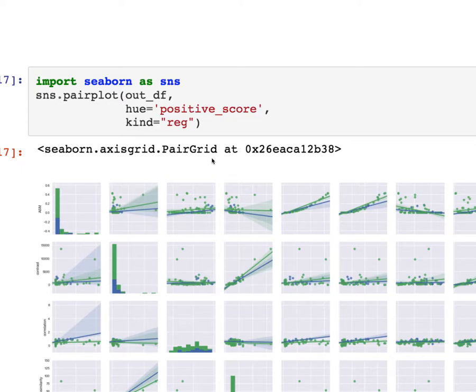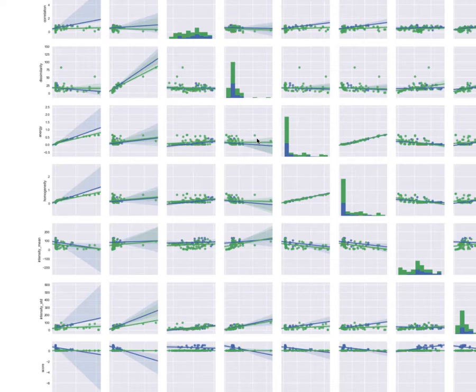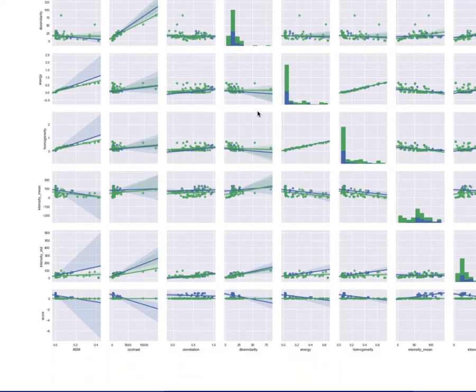This is also one of the exercises where you try to do this with mitochondria, to find out what textures identify mitochondria and which ones don't. This isn't ideal for segmentation, but it can be very helpful for excluding segments that you don't want to keep, or segments that aren't of the right region, because you require a segment in order to do this in the first place, which is why we did this grid.